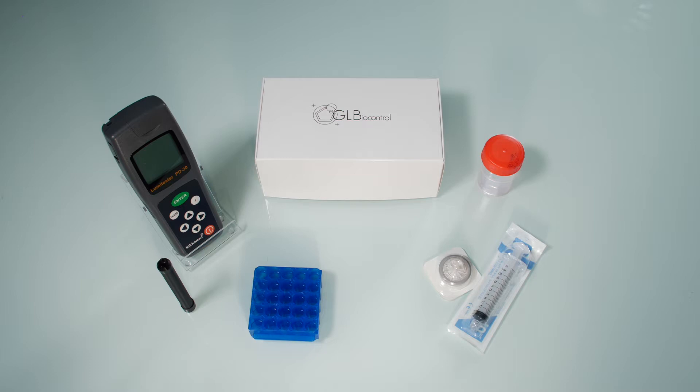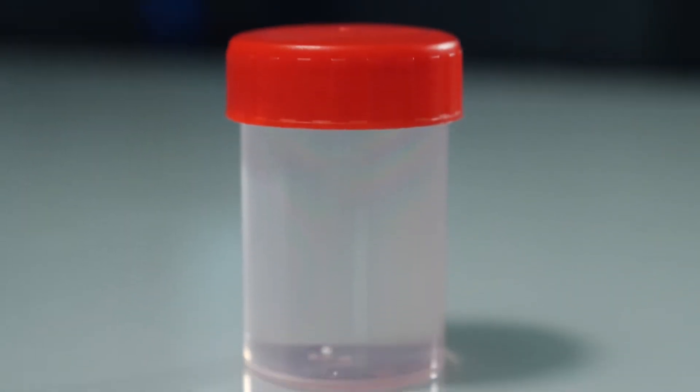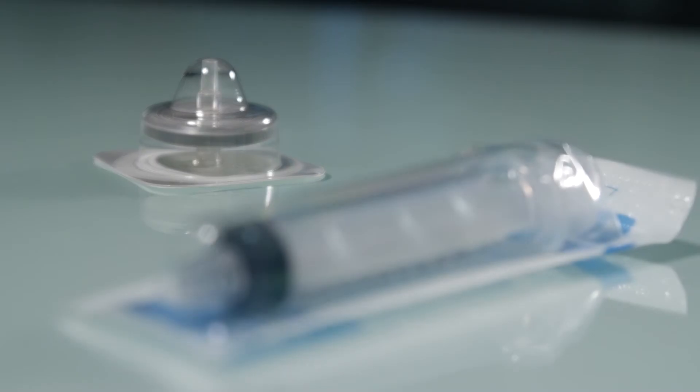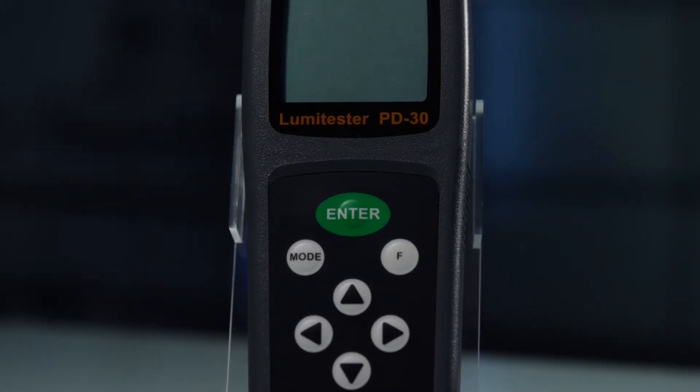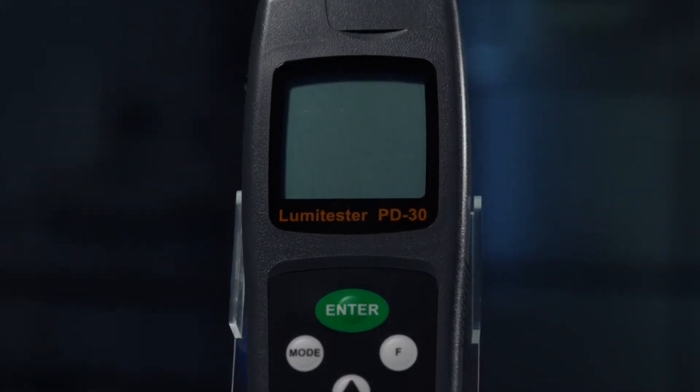To carry out the measurement you first need to set up the red capped container with your sample water, the filter, the syringe, the measurement device, also called a luminometer or ATP meter.